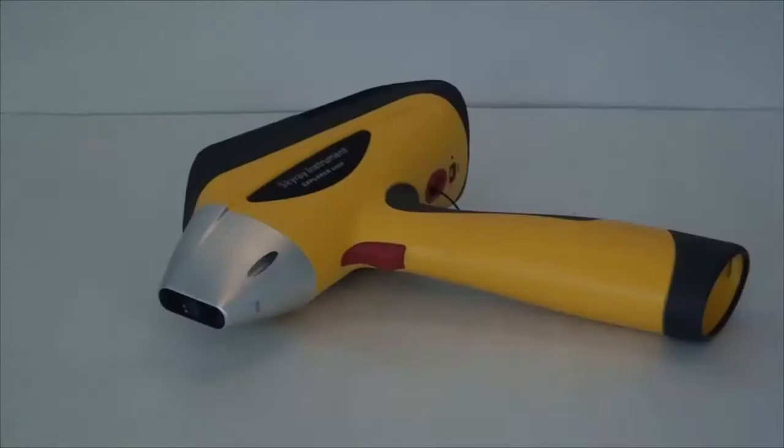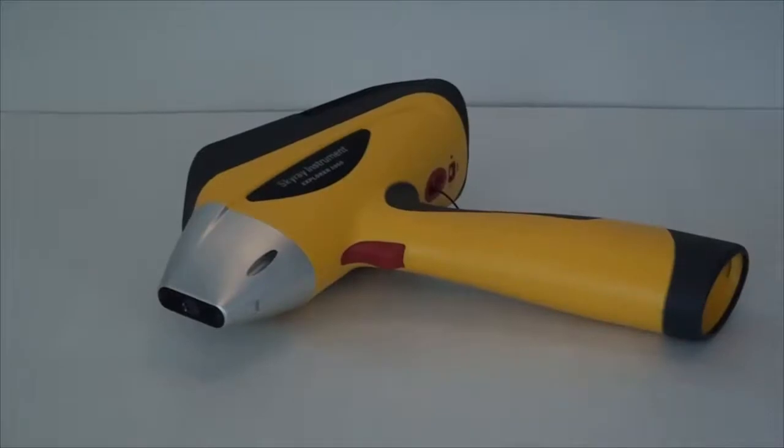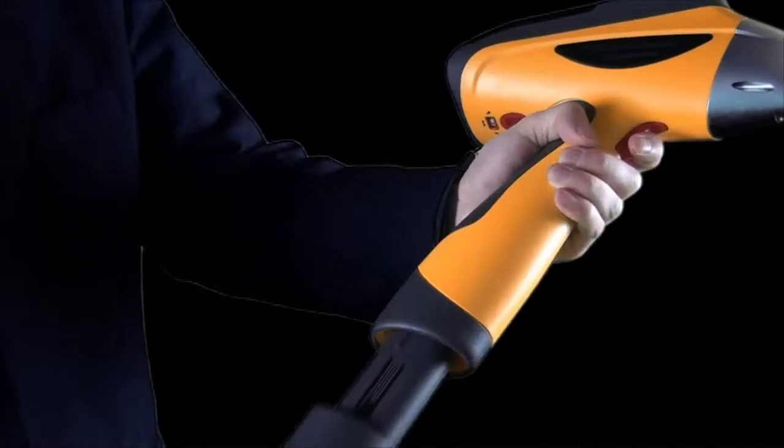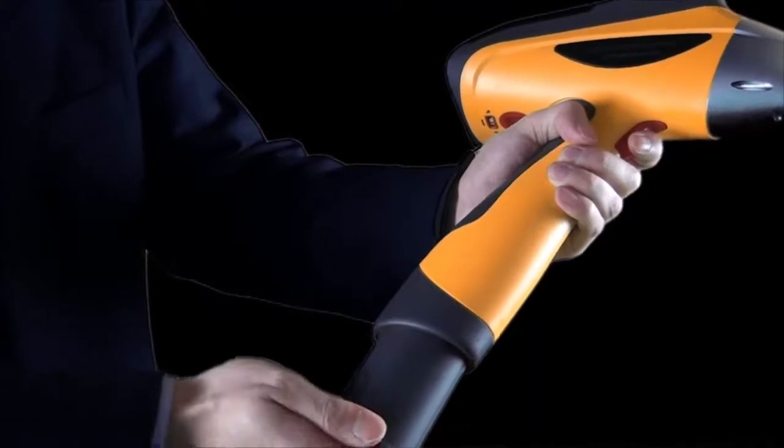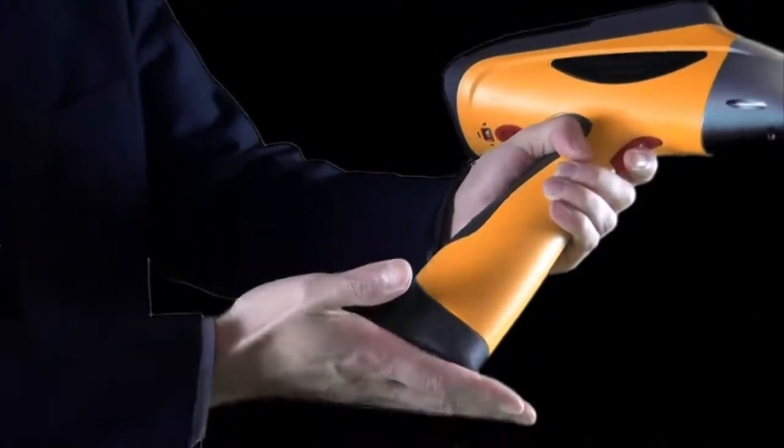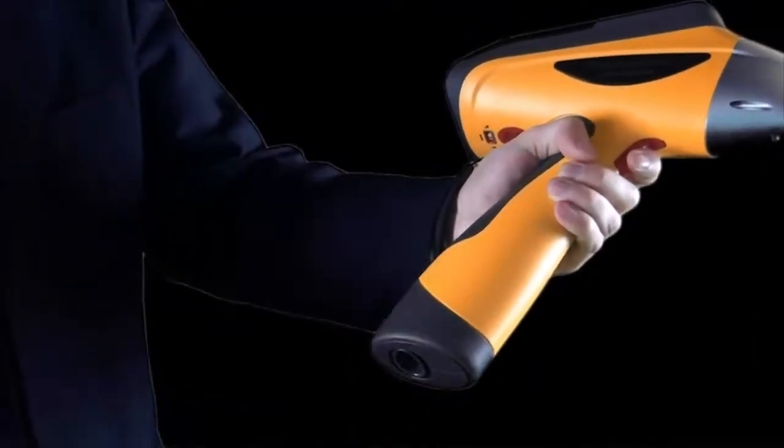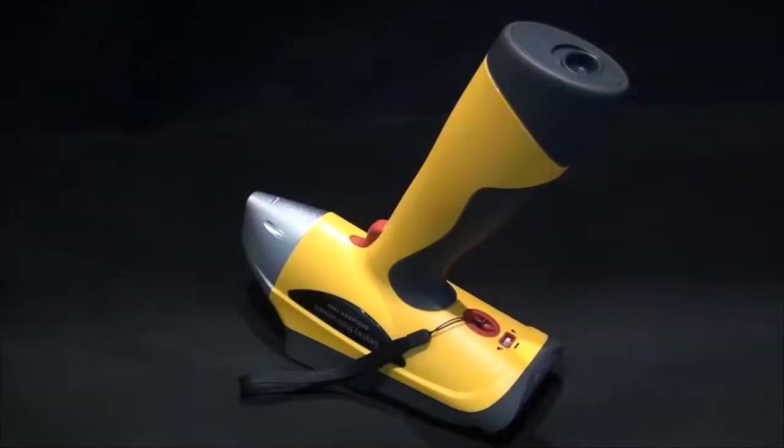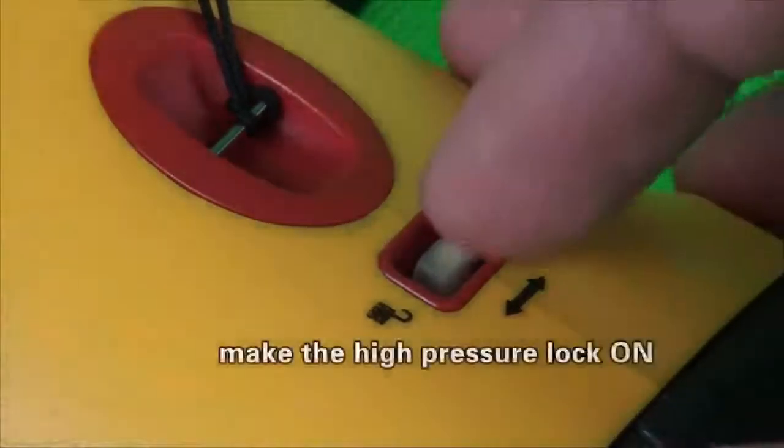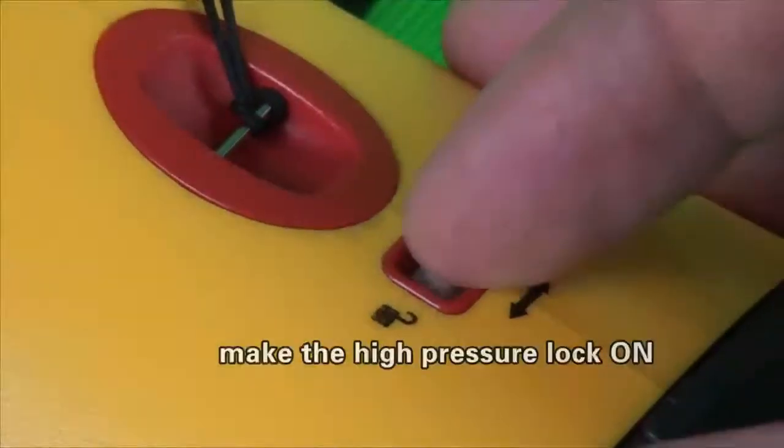Please make sure that the batteries are fully charged prior to the use of instrument. After the instrument is removed, insert the dedicated batteries into the bottom of the instrument and make the high pressure lock on.